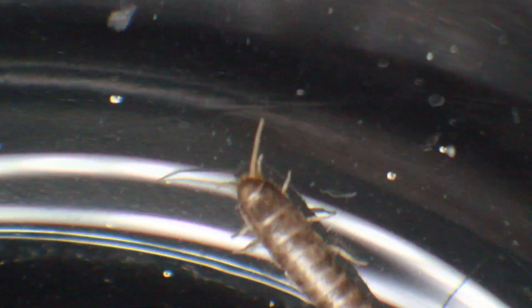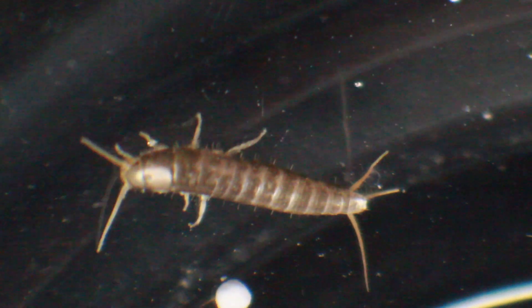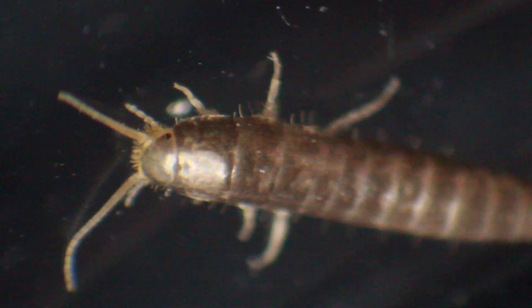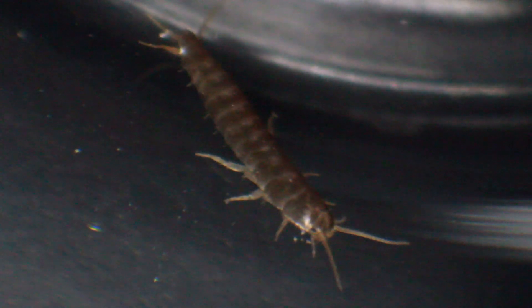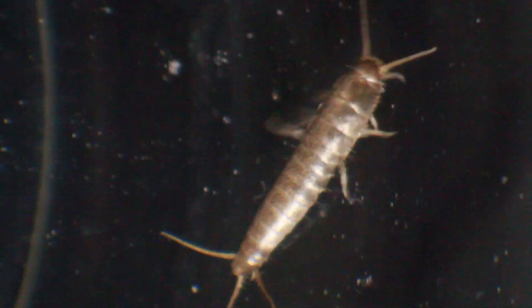This one is a little bit larger than the other one, and the two antennae are quite complete, so this one is not injured. No chance crawling out here. Look at the long extensions on the tail - these are called cerci, C-E-R-C-I. They act as sense organs, and in some insects - maybe not so much in silverfish - they can even act as a weapon. The long tail extensions are very typical for silverfish.